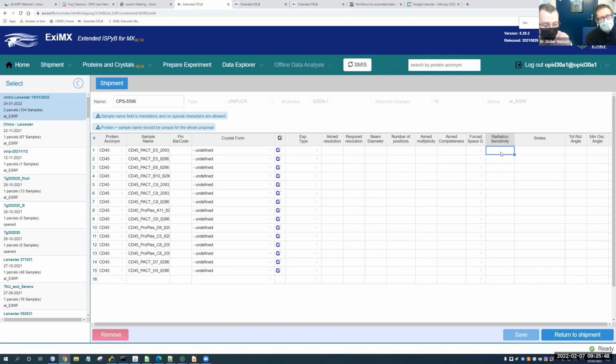So you probably don't need to play a huge amount with this factor, but people have shown that for very radiation hard crystals, you can decrease it down to 0.5, and you can increase your I over sigma I or what have you if you really want to. You use that only if you've got pretty good experience of the beamline and the crystal you're putting in the beamline, which could definitely be the case if you are doing a lot of the same crystals.